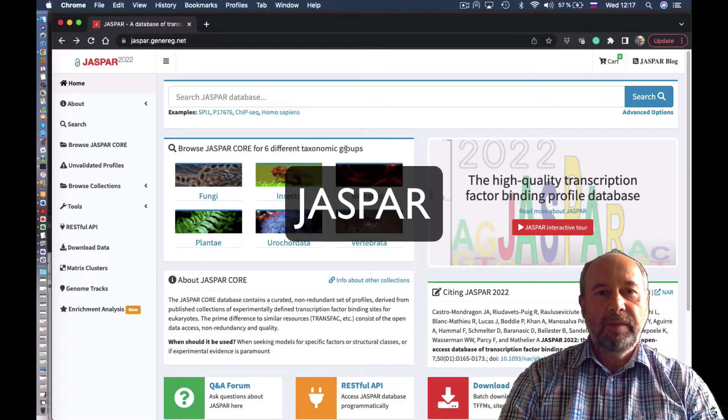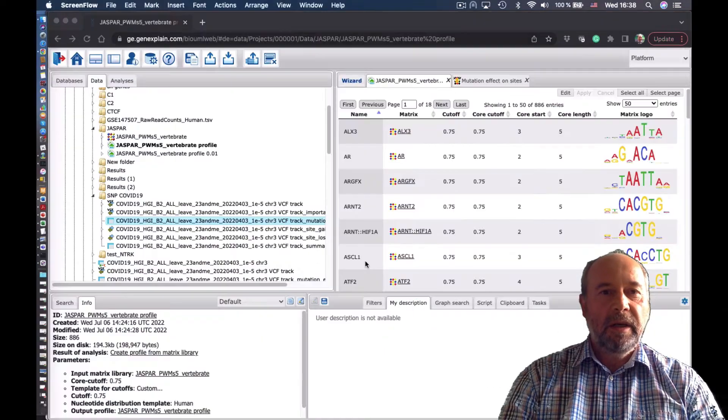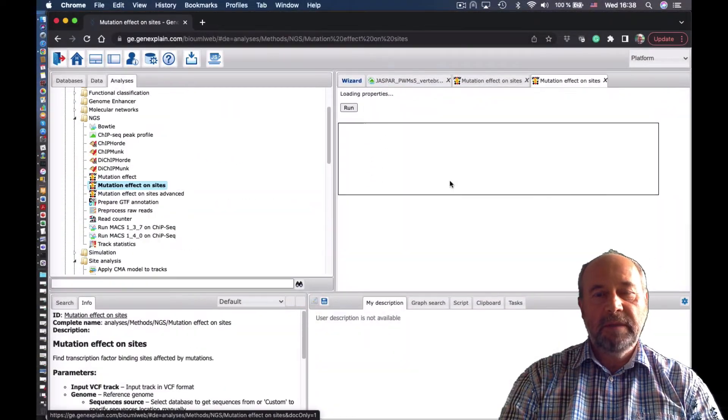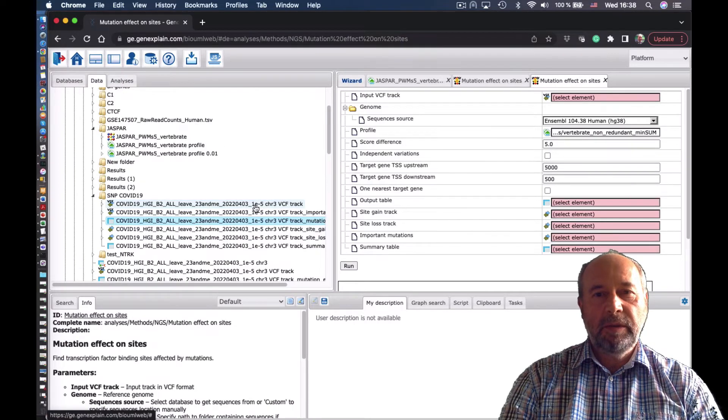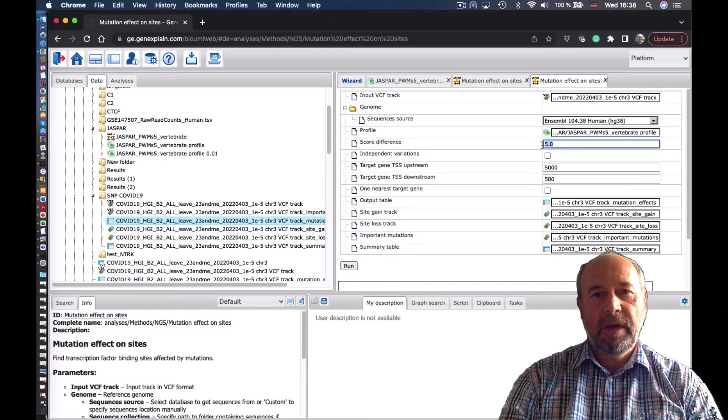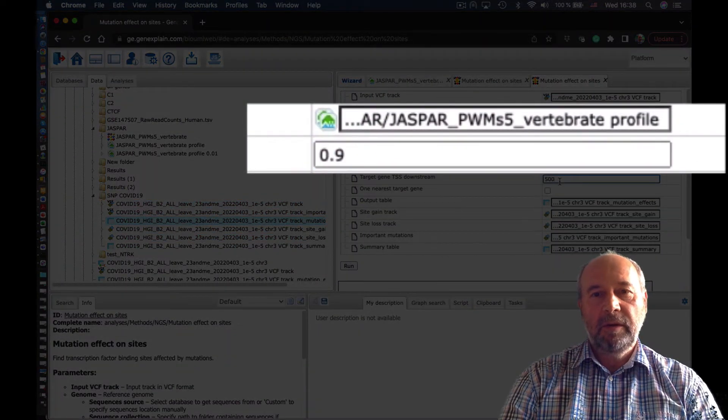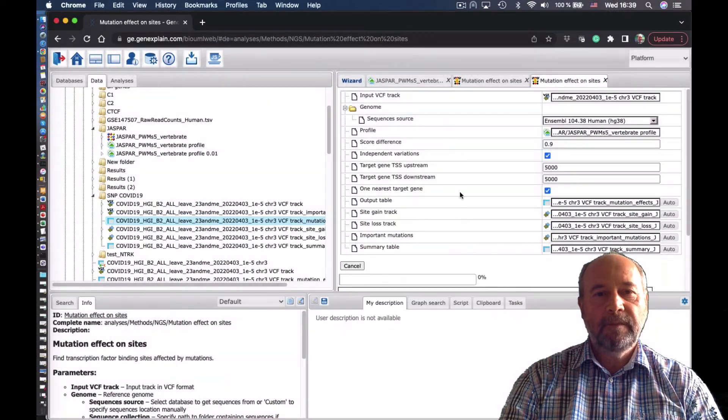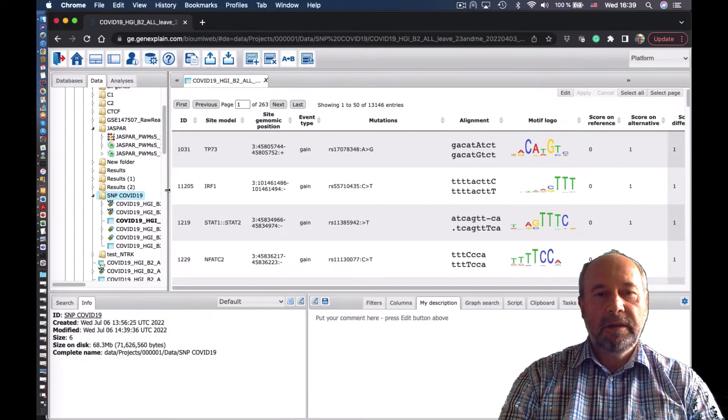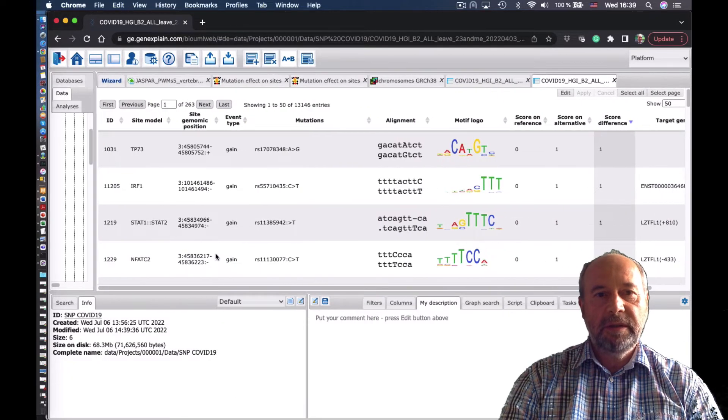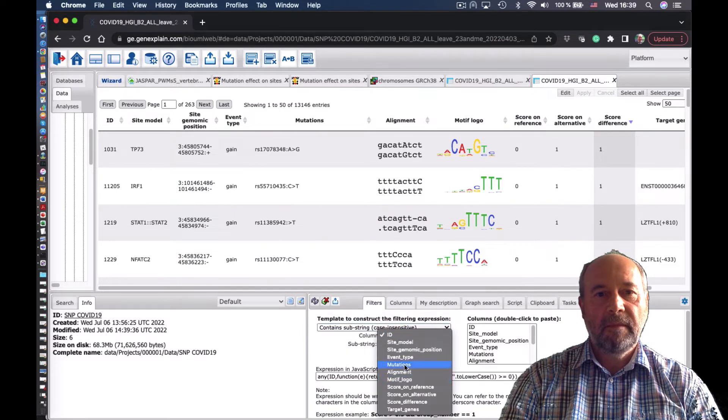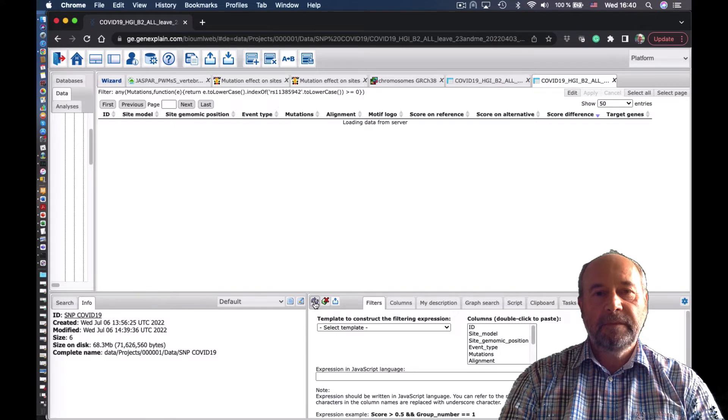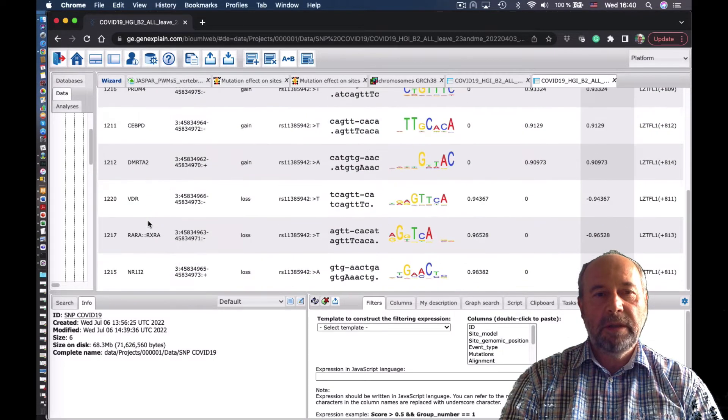Let's have a look at Jaspar database. We go to the latest Jaspar, load it into the platform and run the same analysis. Basically, we take these SNPs, put here the Jaspar profile, the same cutoffs, rename the outputs, adding letter J to the output, and run it. Now we get the results. Again, let's search for the SNPs of our interest. Here, the output is much bigger, so we found several binding sites which changed due to the SNP.